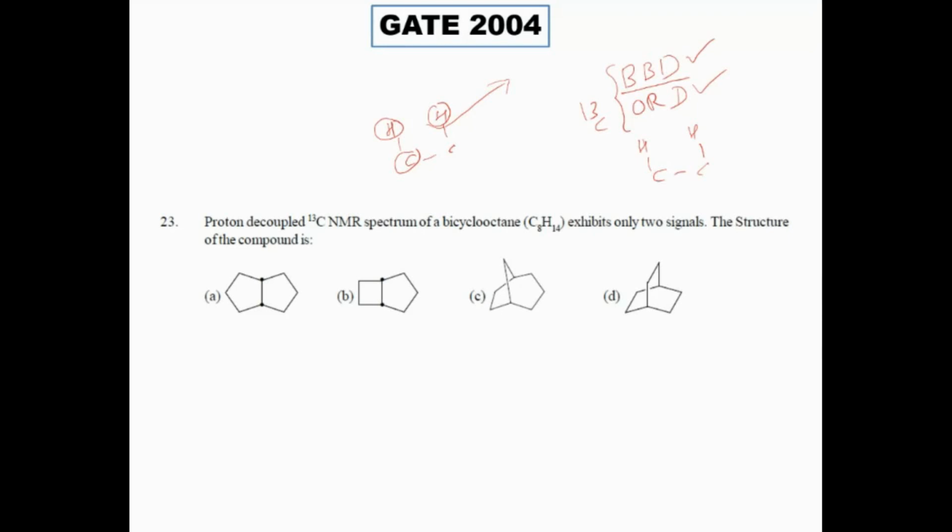So every carbon is isolated and gives only singlets. That is proton decoupling: all carbons have no coupling with their attached or neighboring protons, because we fixed a second radio frequency exactly at the resonance frequency of hydrogens. These are known as spin decoupling techniques. Now the carbons give separate signals, that's all.